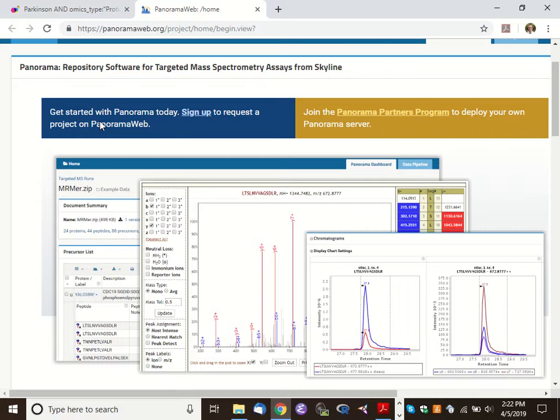All right, so we can see that there's a whole lot of stuff here. One of the really valuable things about Panorama is that they've developed a whole pile of training videos to help teach people how to design their own experiments and how to analyze their own experiments in this software. It's kind of rare that you can just go to YouTube and punch in a software name and get back a whole bunch of training videos, right? So that's a very valuable thing.